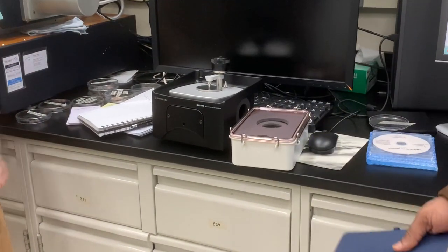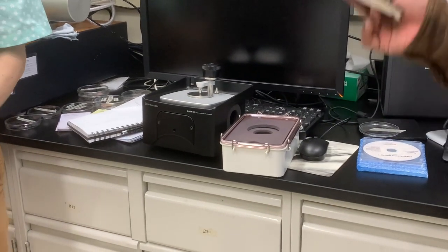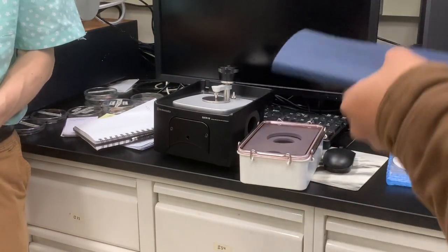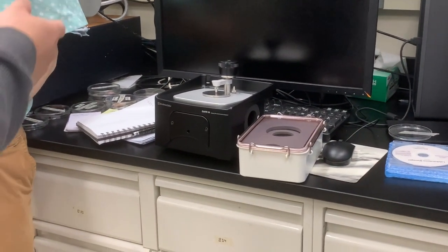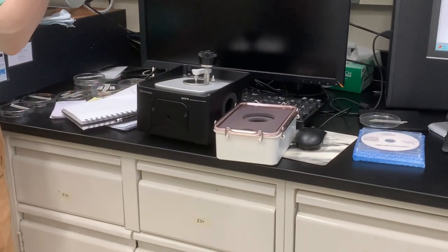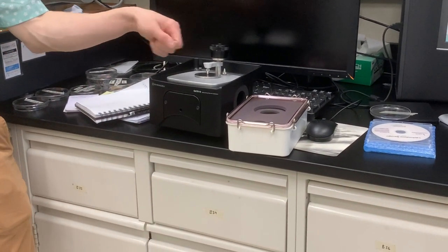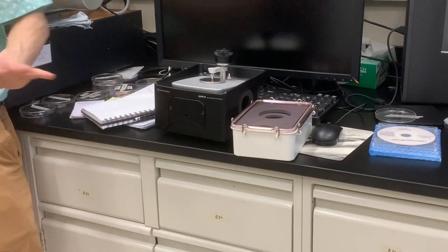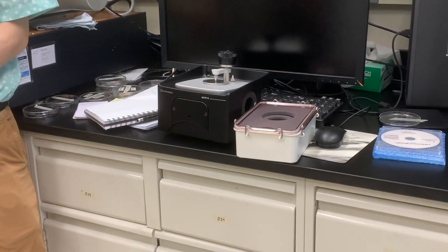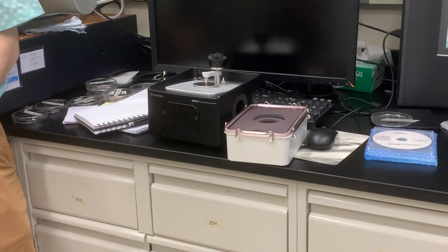I kind of use something like this. We had a different brand, old one, for the powder. Oh, okay, you can also put powder here. Yes. Now, what I would not do is take a metal utensil and scrape across the crystal. Believe me, I didn't think I would have to say it either. It's gonna break that setup.